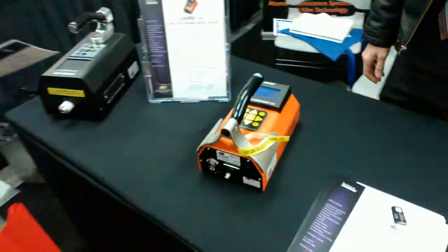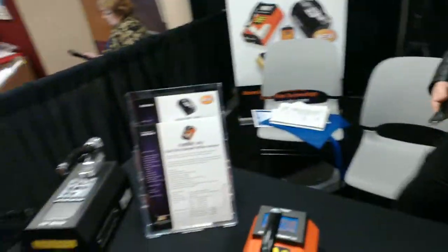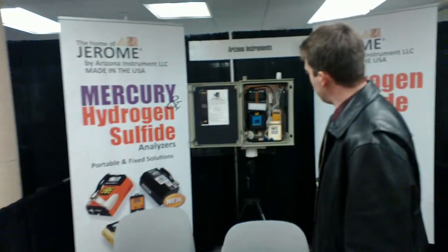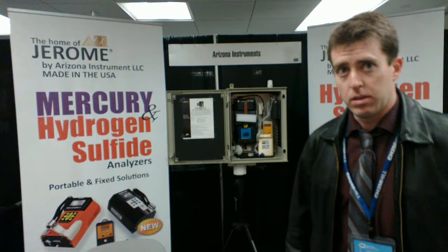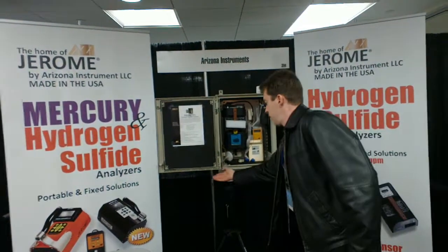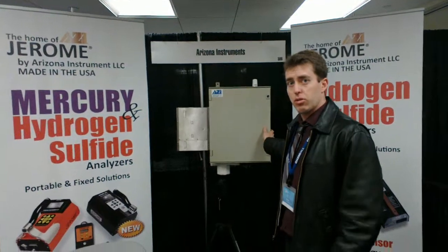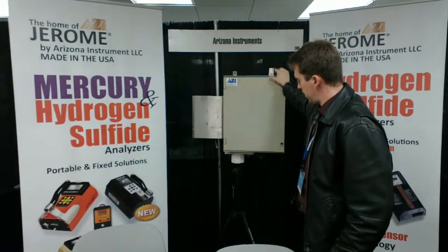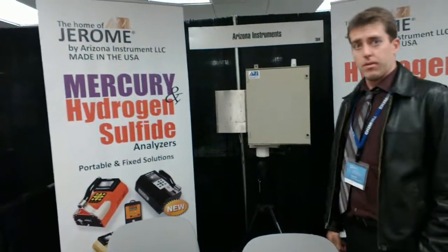Very interesting. And this one? That is one of our stationary units. Essentially it's a smaller handheld unit that comes out of a box, designed for long-term monitoring. Does it have a battery inside, or does it have to be plugged in? This has to be plugged in — 120 or 220 AC, based on which version you get. It's got a radio system on there, samples from down here. This is an AC heater unit with 4 to 20 milliamps.